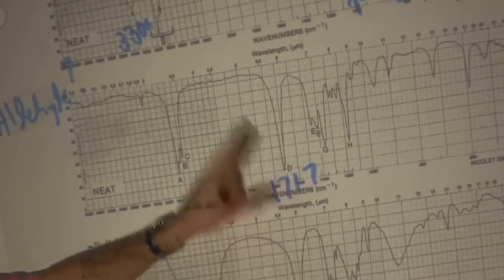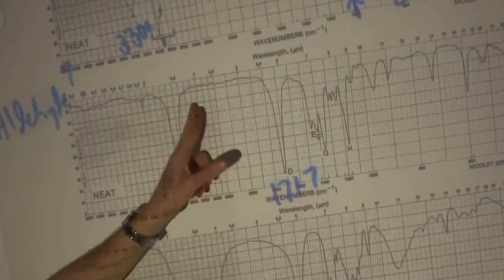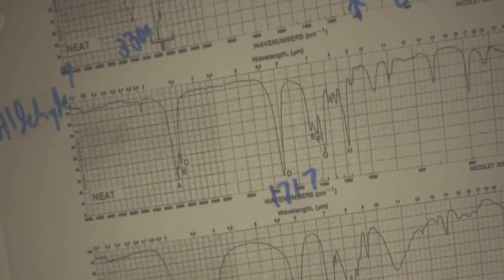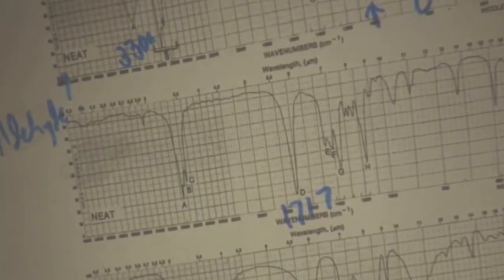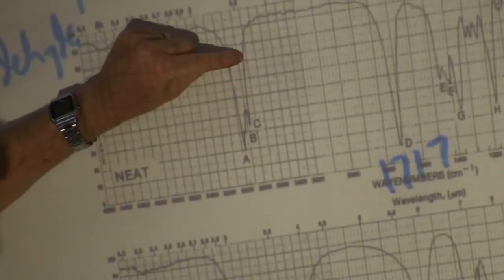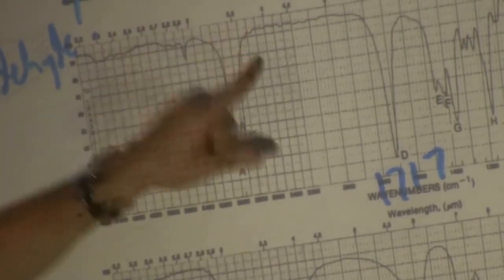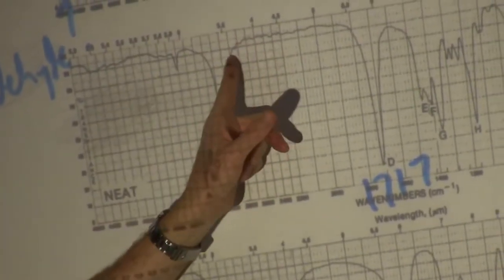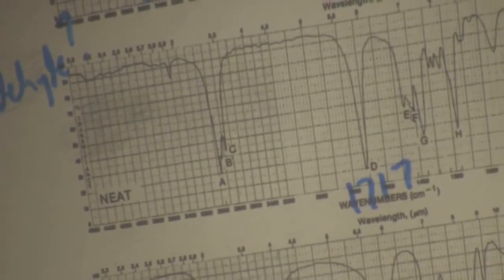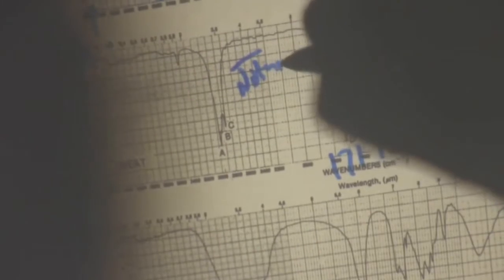So it's a little low for an aldehyde. We're shy on anything over here. You can draw with a pencil a line right here at 2840, and there's just nothing that looks distinct. They're just little teeny resonances. So there's really nothing to speak of here at 2820, 2720.